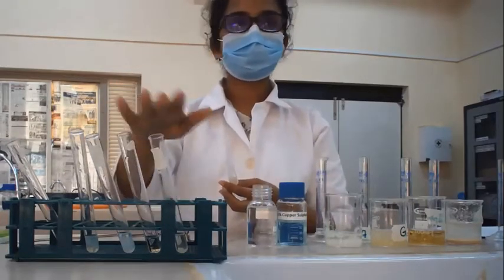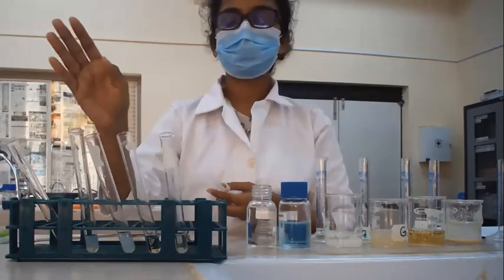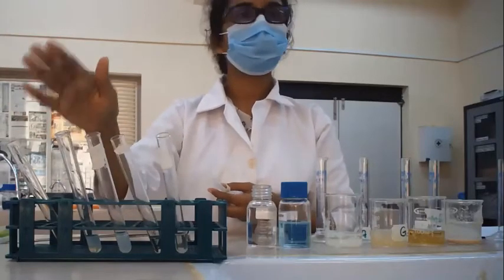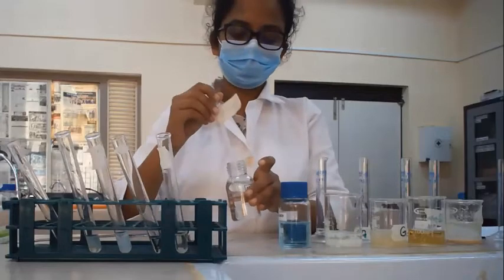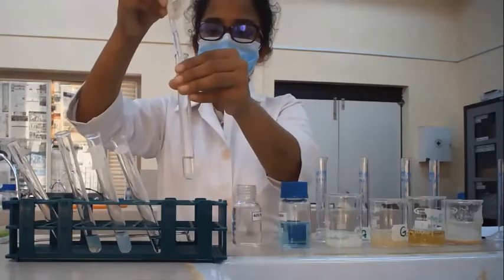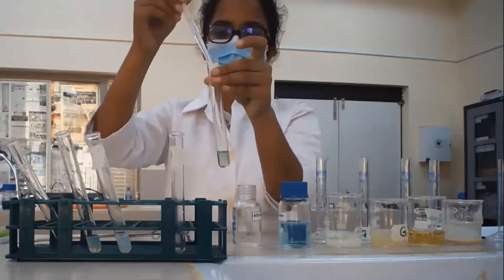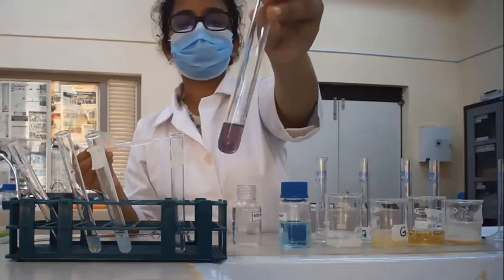We have already added copper sulfate into this test solution, that means casein, peptone, albumin and gelatin. And now we are going to add sodium hydroxide into each of these test tubes. So we are going to add a few drops of sodium hydroxide. You may see a color change in this solution.